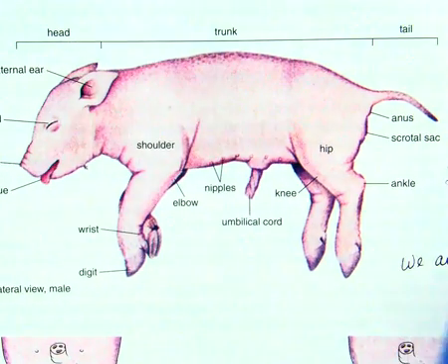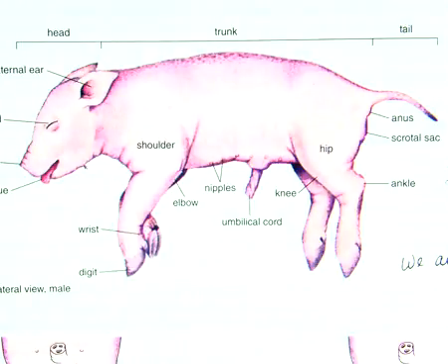So here we get the overview. Again, they're fetal pigs. They've never been born, so there are some differences to consider. This means they don't have much subcutaneous tissue. In other words, not a lot of fat and connective tissue, which makes our dissection a little bit easier.